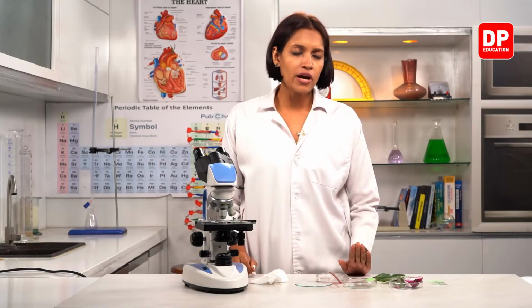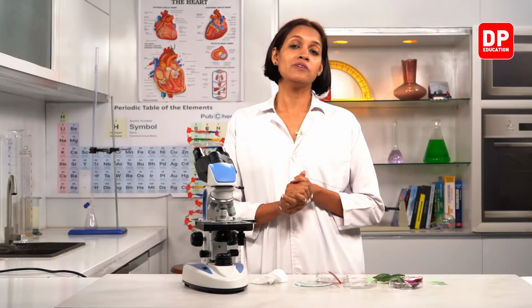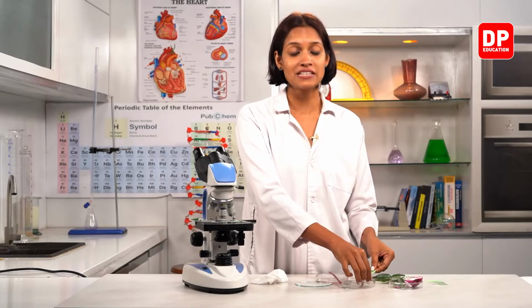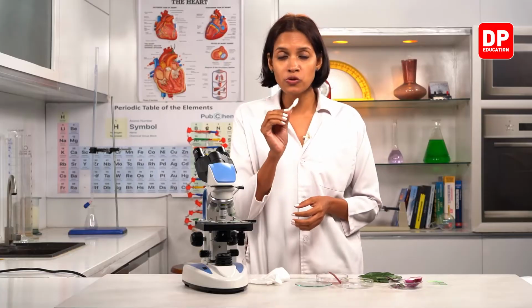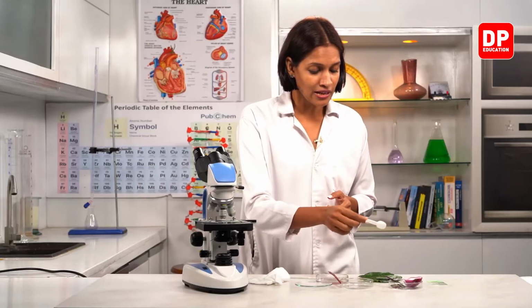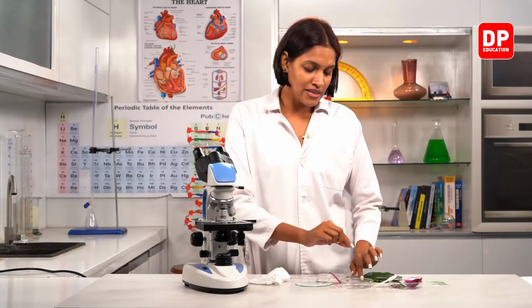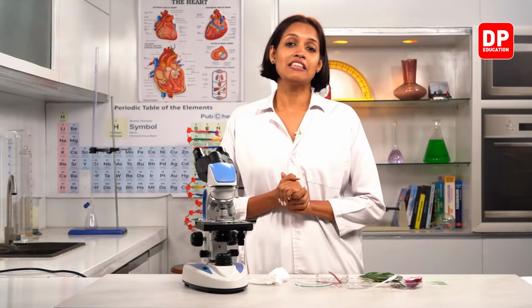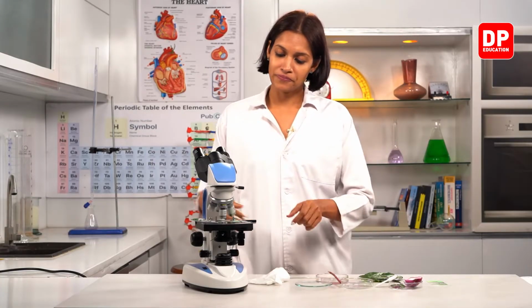Okay? Now we are going to observe the human cheek cells. Now I'm not going to make the specimen with the human cheek cells. Instead, I'm going to use a previously made permanent slide. So in order to make a human cheek cell slide, what we have to do is, using a yogurt spoon like this, scrape some cheek cells from the inner side of your mouth, and then you have to place them on a slide, and we have to make the slide in the same way we made these other slides. Okay, so here I'm going to use a permanent slide for that.